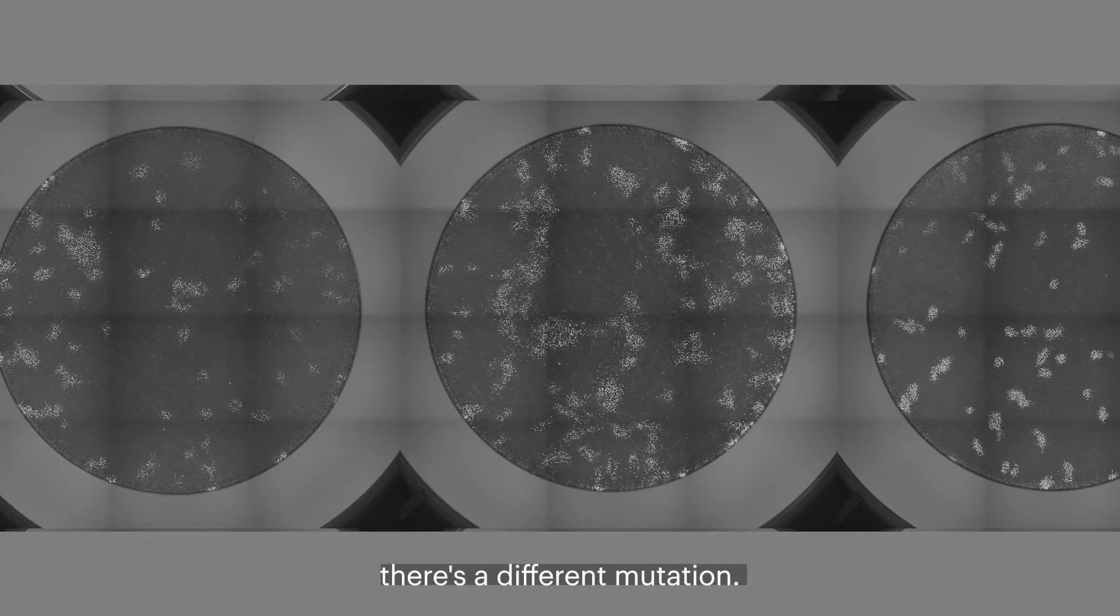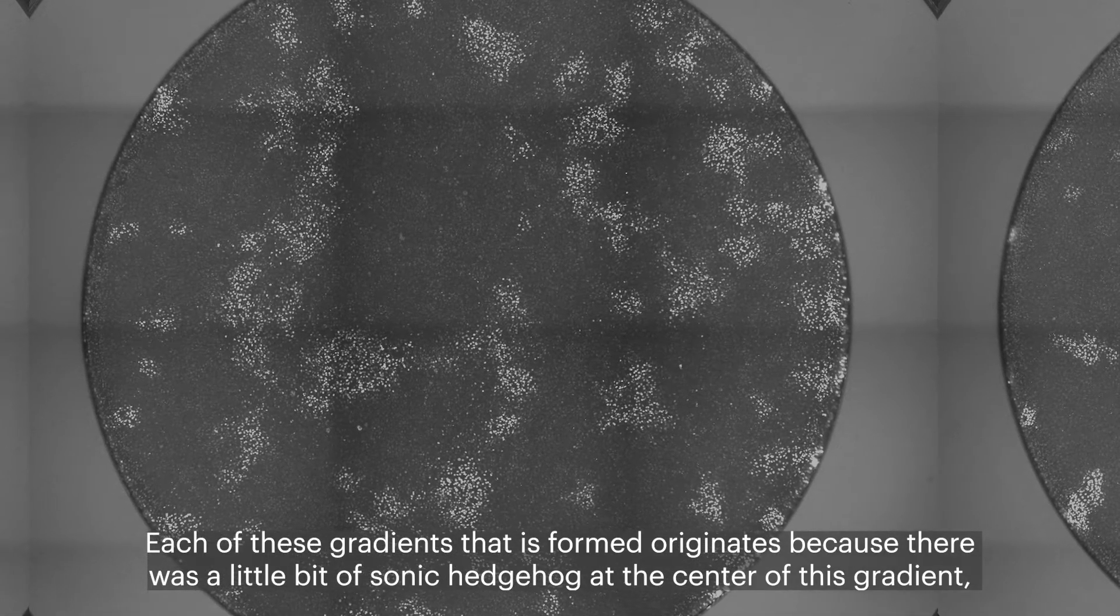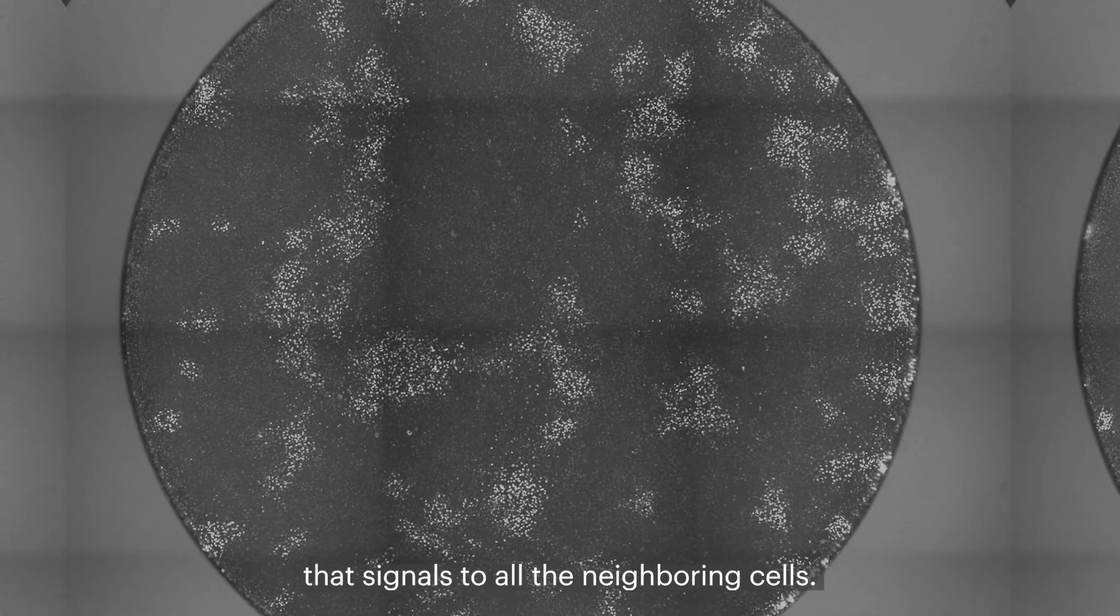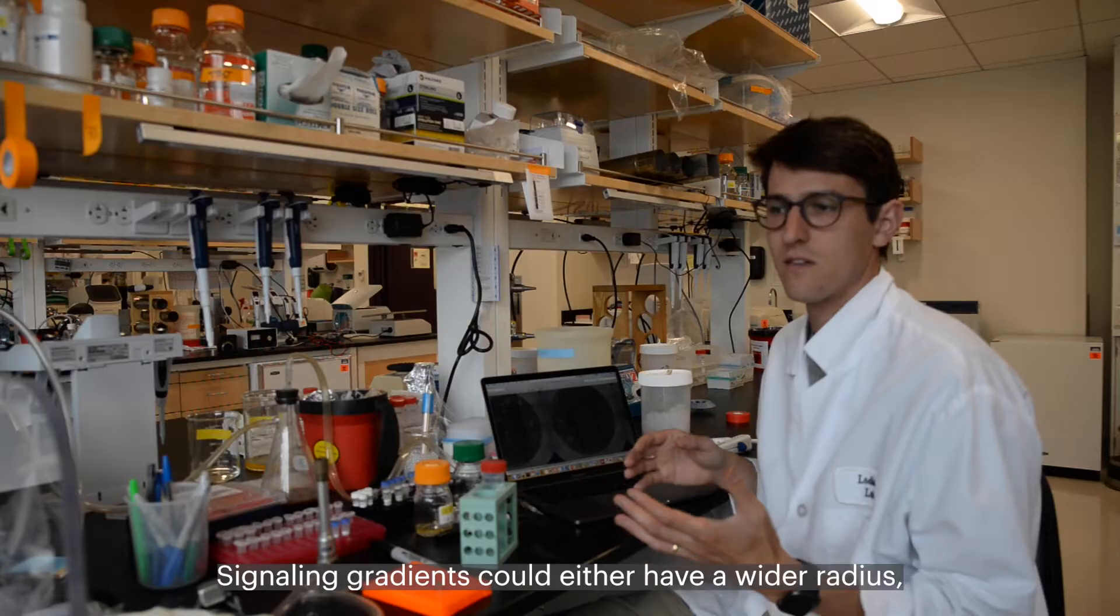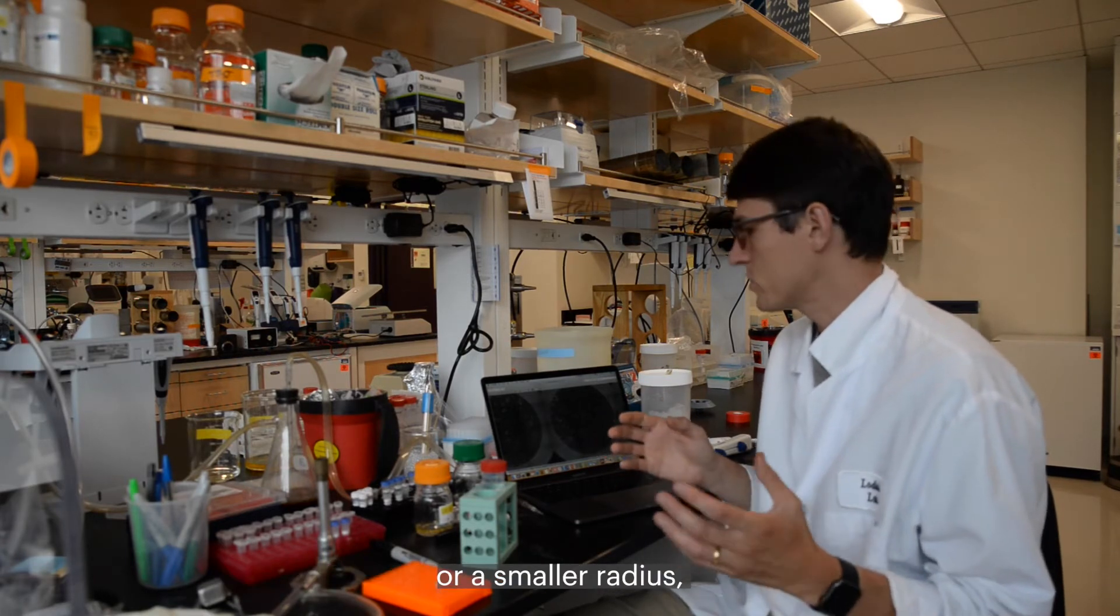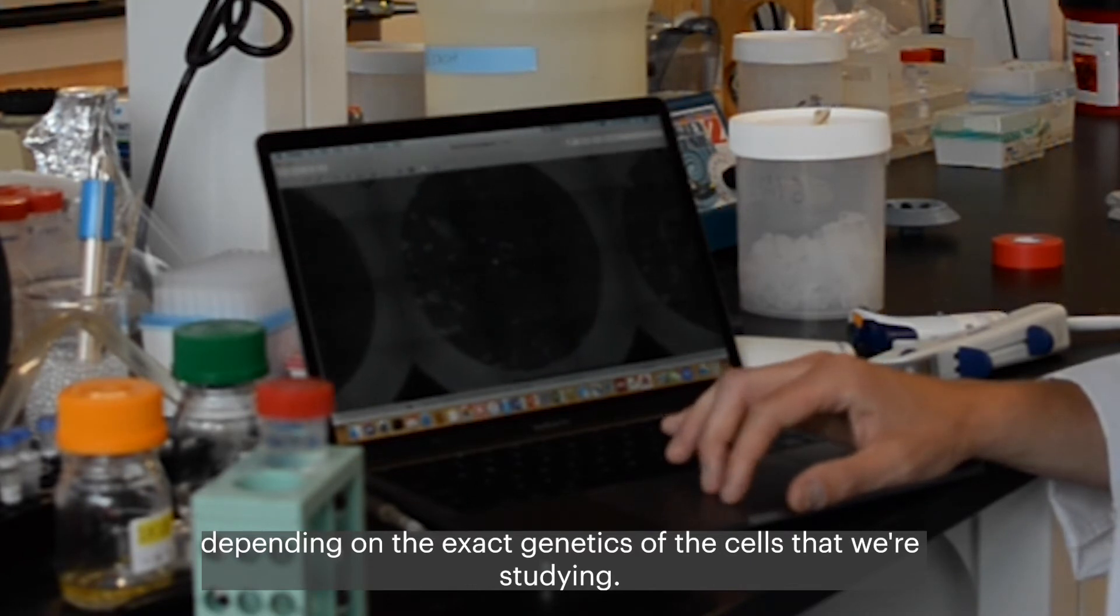So in each of these six wells, there's a different mutation. Each of these gradients that's formed originates because there was a little bit of sonic hedgehog at the center of this gradient that signaled to all of the neighboring cells. The signaling gradients could either have a wider radius or a smaller radius depending on the exact genetics of the cells that we're studying.